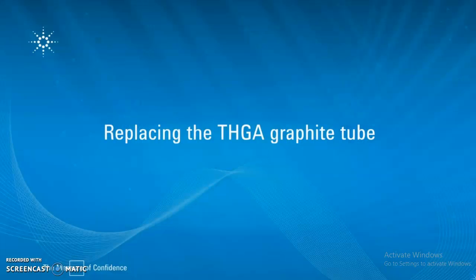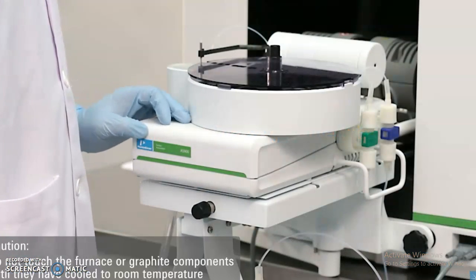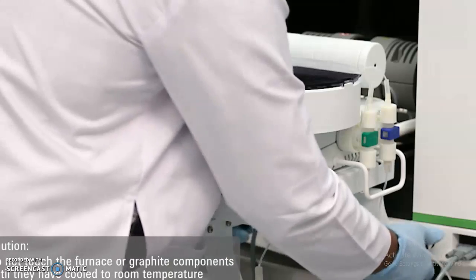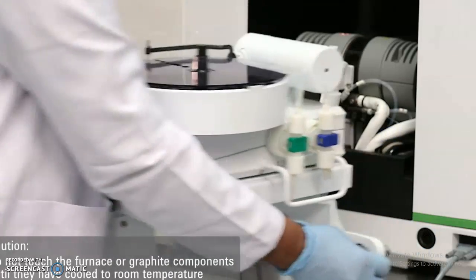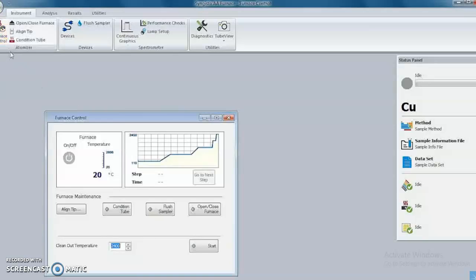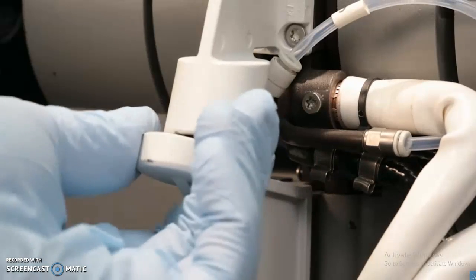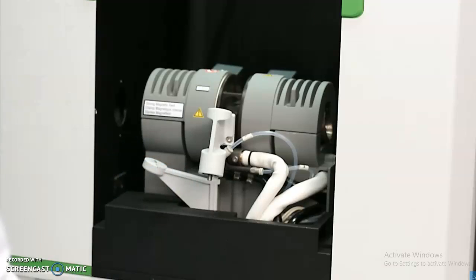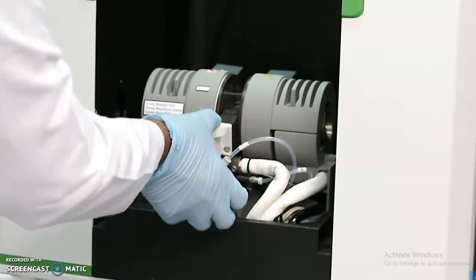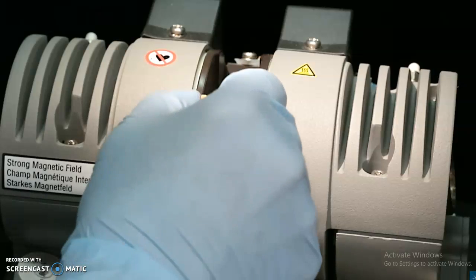Before we replace the graphite tube, we need to clear the autosampler. Release the left and the right locking knobs and swing the autosampler away. Click the open-close furnace button in the furnace control window of the software. Then, swing the support lever to the side. Tilt the front contact housing downwards. Use the insertion removal tool to remove the graphite tube.